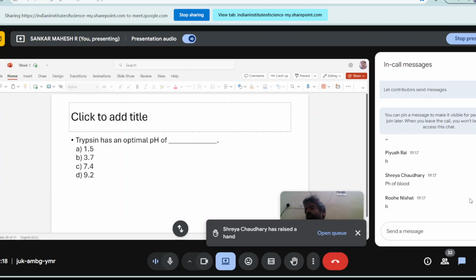Right. Let's just make it clear for everyone. In cell culture, you have two modes of growing. You either grow a suspension culture, which means your cells can survive when growing in a liquid medium and in rotation as well. But when you have adherent culture, your cells have to stick onto a surface at the bottommost layer. So here cells grow as layers, and they can survive only if they are connected and grown as a layer. So this is the adherent cell system. And when you trypsinize your adherent cell culture, the cells are detached, and you can take your cells away. That's what Shreya mentioned.